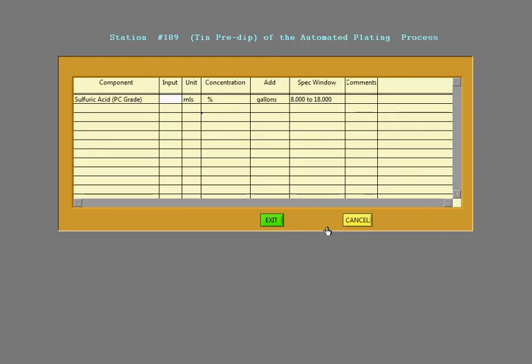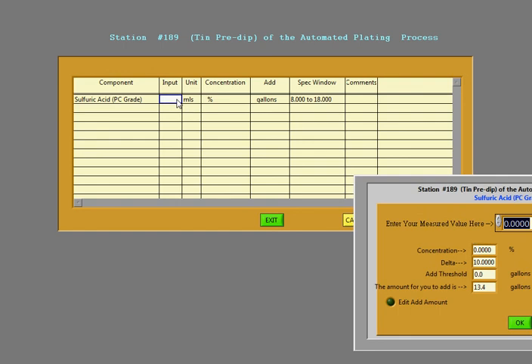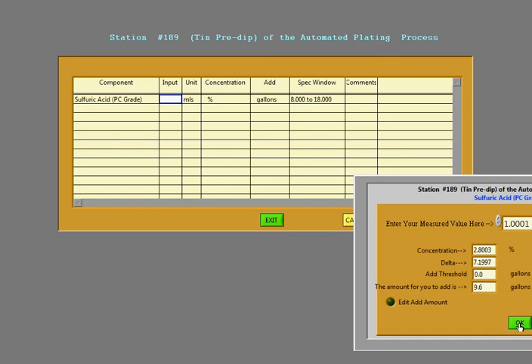And we're going to click on this window. We're going to put in. Let's see here. So let's just say. We're going to make this out of spec. So we're going to put in one mil. And we'll need nine gallons. We're going to hit OK.